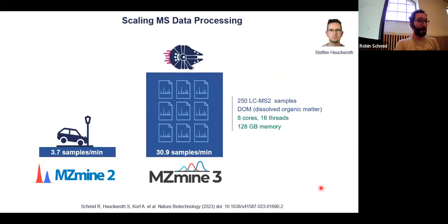And then for the development of the last year, MZmine 3, we released it like March, 1.5 years ago or something. And we already developed it for a long time. Maybe some people were waiting and were like, why is there no new release in MZmine 2? And if any one of you is still using MZmine 2, I tried it out like 1 year ago, and it was such a pain to set anything up.